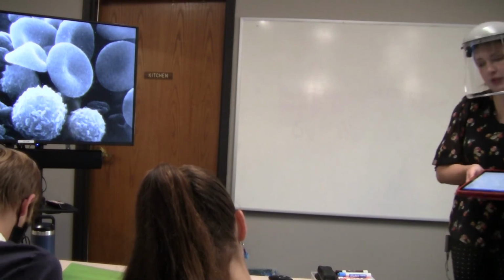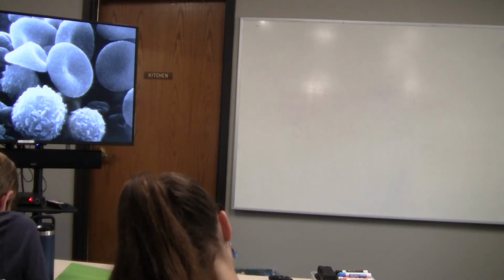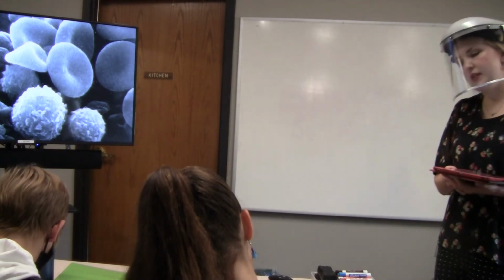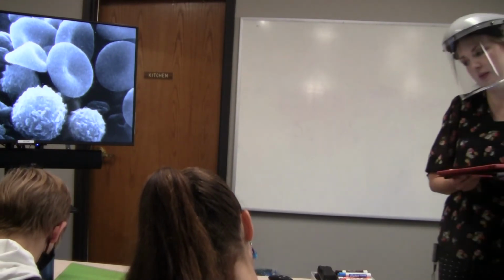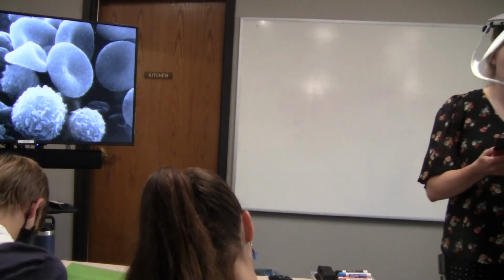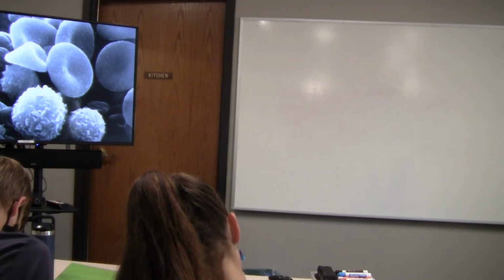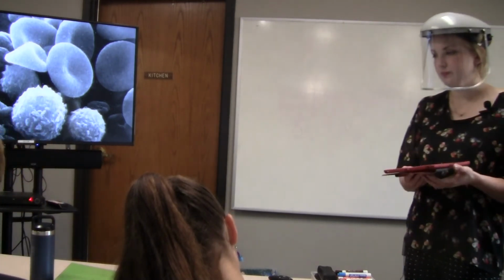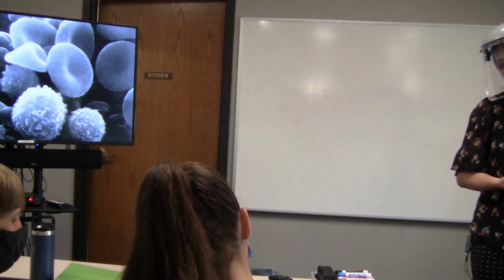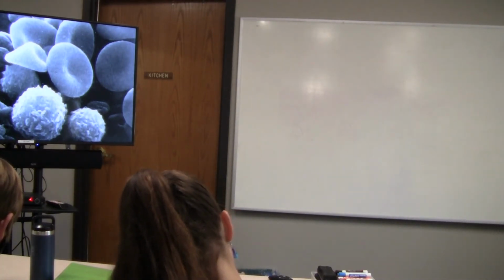Holds the slide in place on the stage. Those are the stage clips. The lens or system of lenses in a microscope that is nearest the object being viewed. Those are called the objectives. So the objective lenses are the ones that are 4, 10, and 40 times. Holds two or more objective lenses and can be rotated. It's the nose piece.